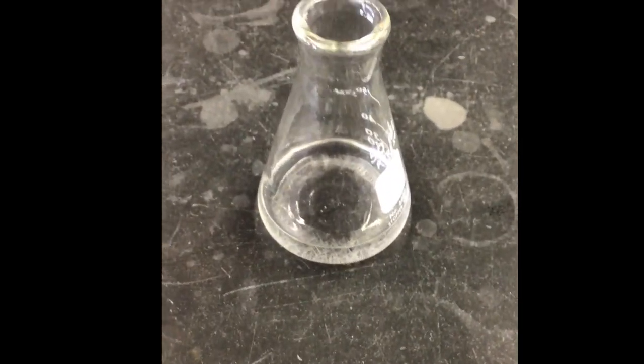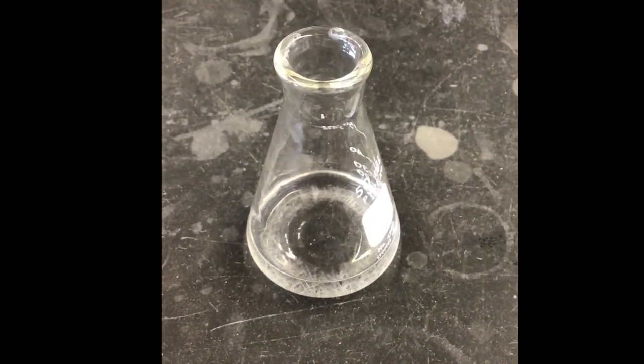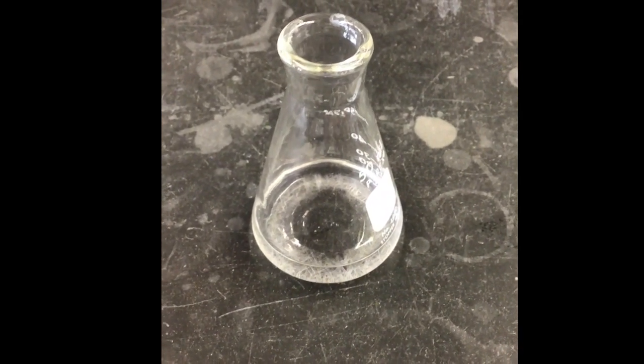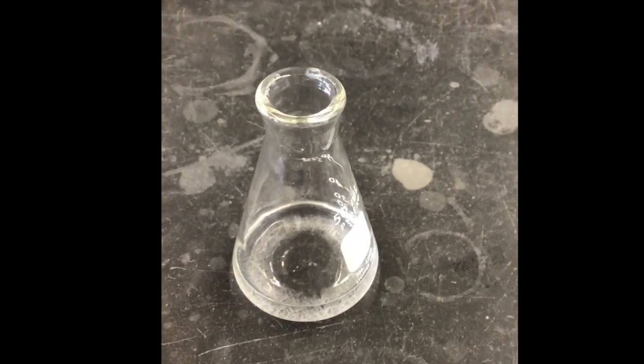And this is actually just creating something called a nucleation site. A nucleation site is just like an imperfection in the glass, or like a porous portion in the glass that allows the solid caffeine material to start crystallizing on.